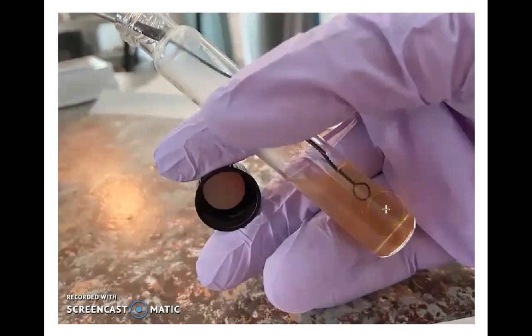That's just good practice. It's also good practice not to allow the handle of the inoculating loop to get too far into that tube. And that's because, if you recall, we didn't sterilize this handle. We sterilized the wire, or at least the bottom half of the wire. So try not to put any more of that handle into your culture tube than absolutely necessary.